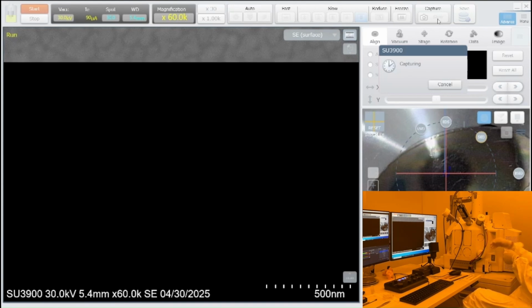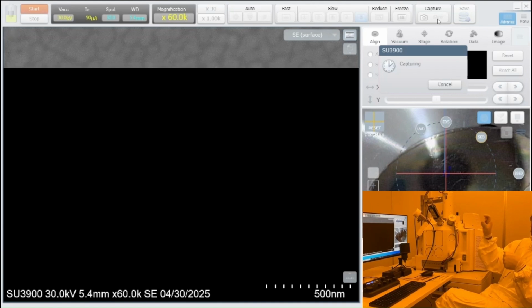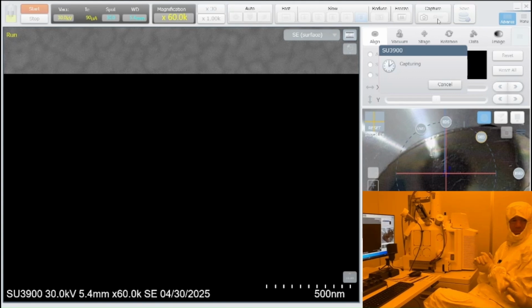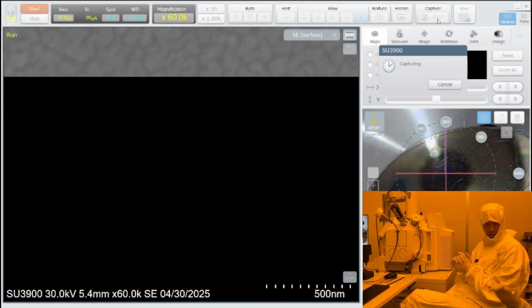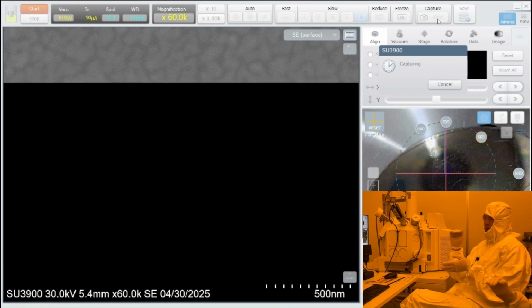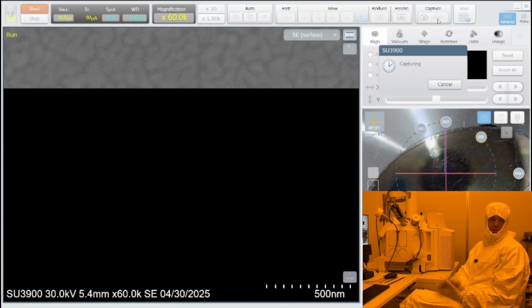So when you're loading it and you see that it's going to fit under there and there's still a little gap, you back it out and you hit up or down. If you hit up, it's going to move up 0.5 millimeter. So once the sample is inside, there's no way we can adjust the Z higher? No. We can get it down, but not higher, because we're setting our max height because we don't want to run into any detectors. So it's kind of a safety feature.